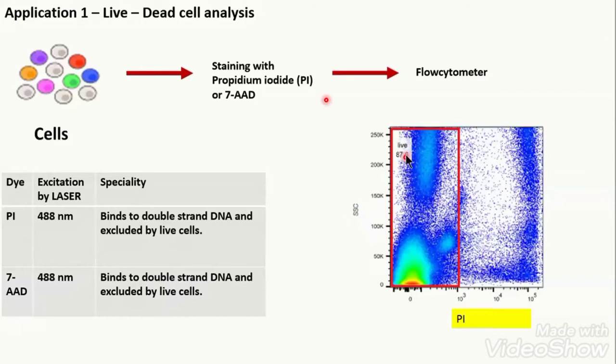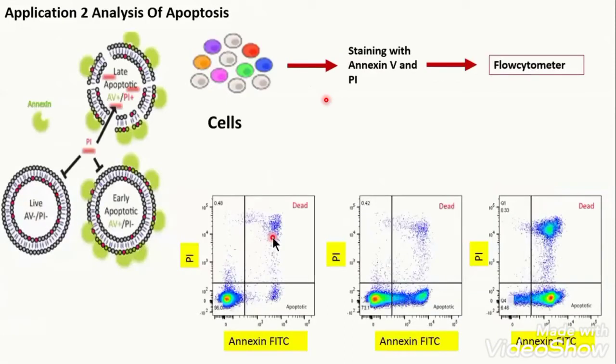we can further extend our knowledge of cell death caused by your drug or by your molecule, where we can analyze the cause of death. So generally, if we are working on anti-cancer drugs or cytotoxic drugs by which we can kill target cells, we want those cells to undergo signaling-based death or apoptosis, that is programmed cell death. We don't want our drugs to cause cell death by some mechanical stress or by some other kind of necrosis or other kind of toxicity.